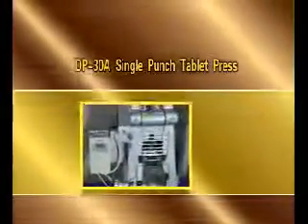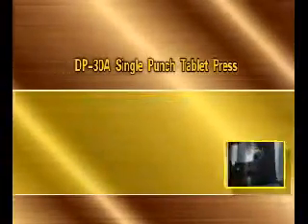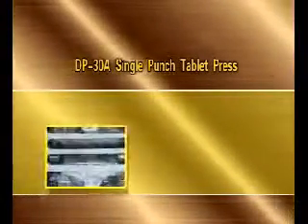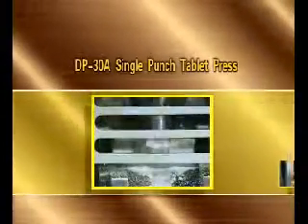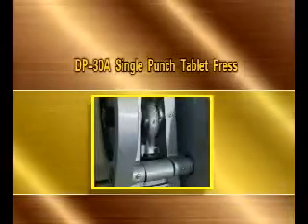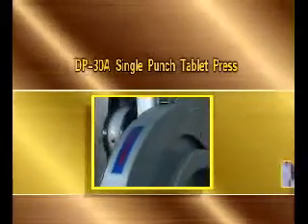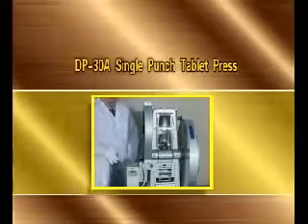Model DP30A Single Punch Tablet Press is designed for laboratory use. It can press granular powder into tablets. It is widely used in pharmaceutical, chemical, electronics, and food industries. It features rational structure, easy operation, convenient maintaining, small volume and low noise. The power is single phase, civil power.